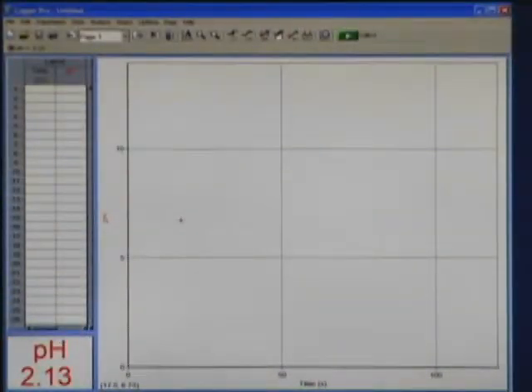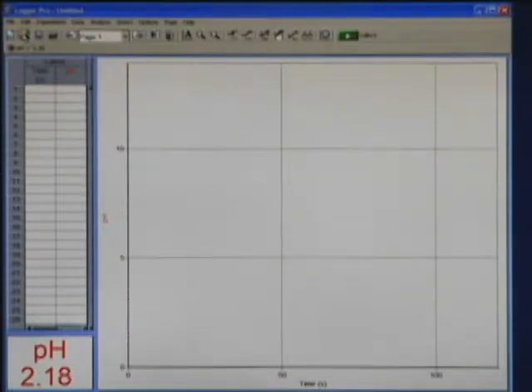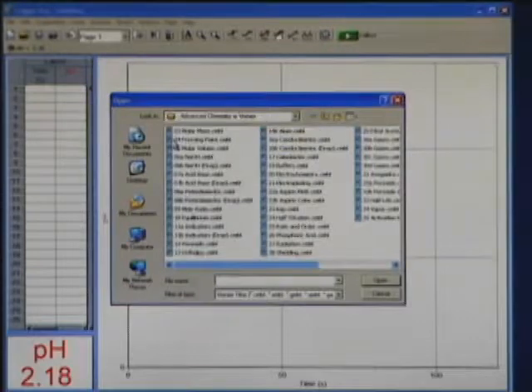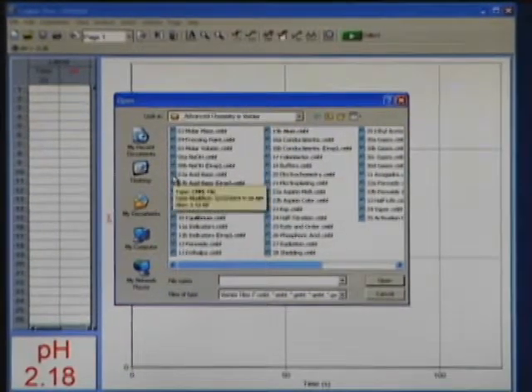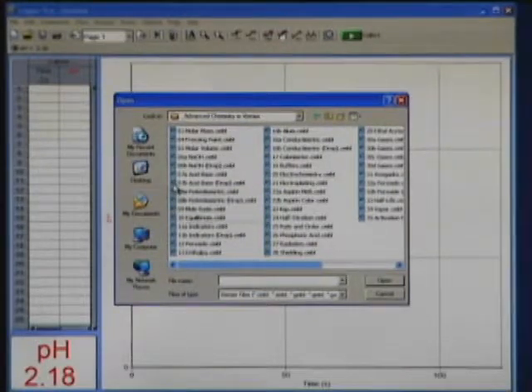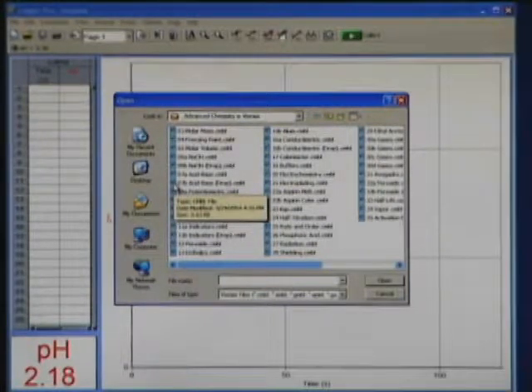So on the computer in Logger Pro, I'm going to open an experiment file from the Advanced Chemistry LabBook. In the Advanced Chemistry with Vernier folder, I'll open up lab number seven. Now there's A and B. A is with a burette and B is with the drop counter, and we're using the drop counter, so I'll open 7B.